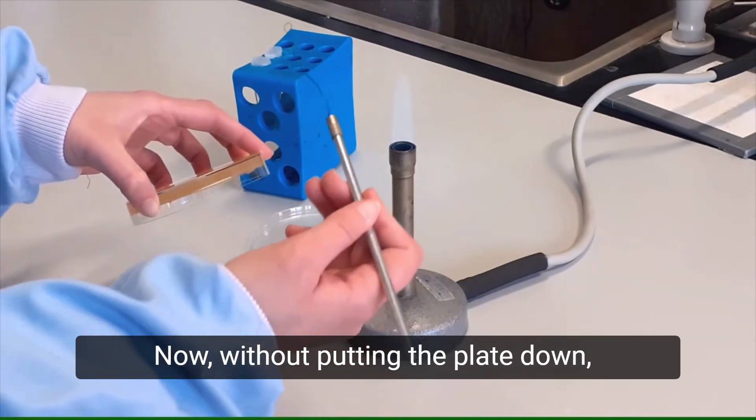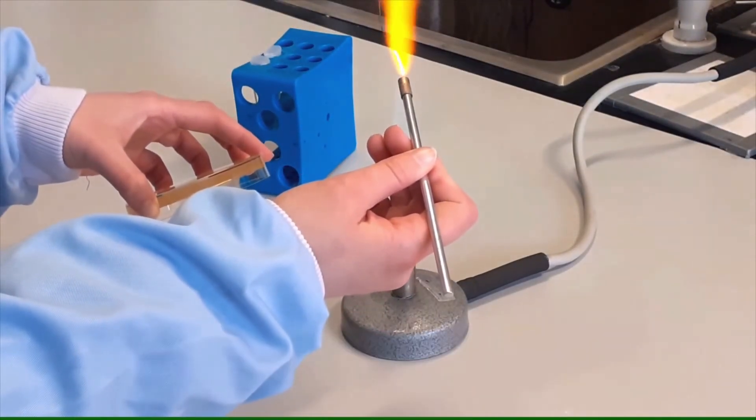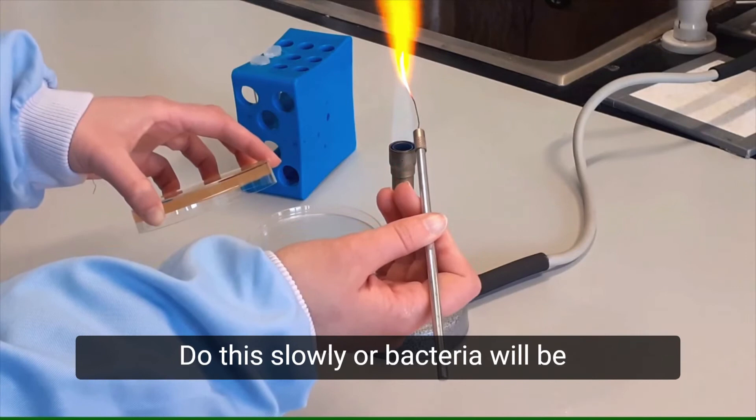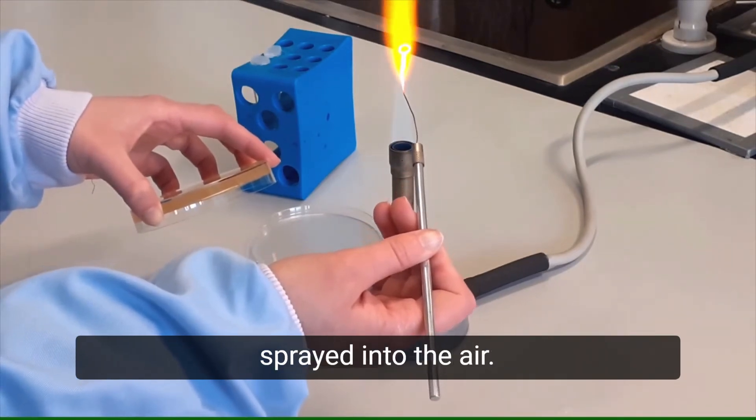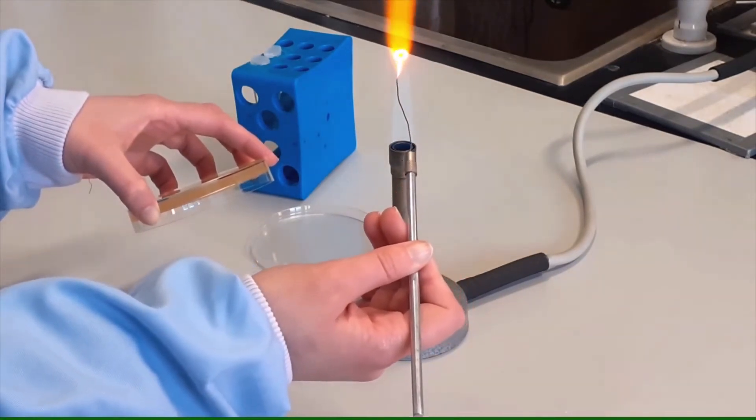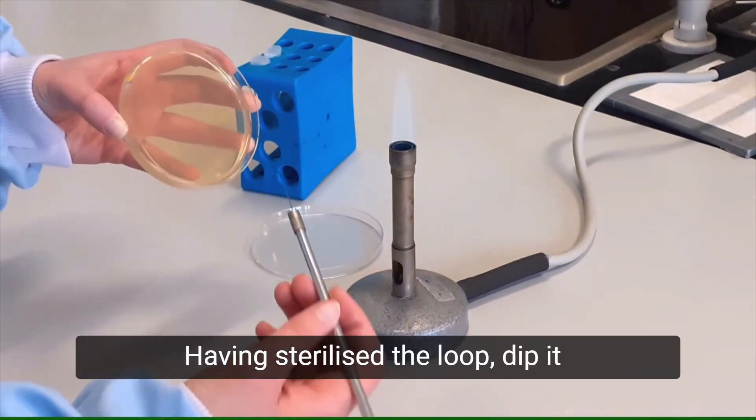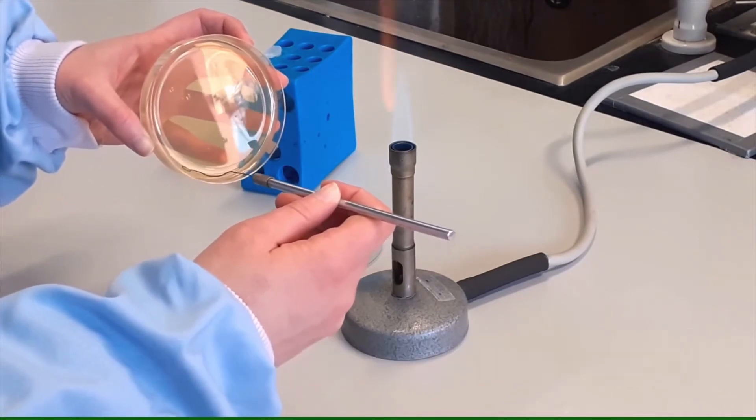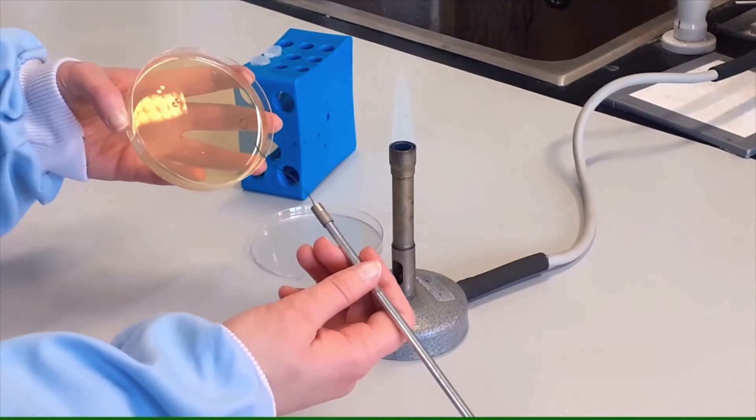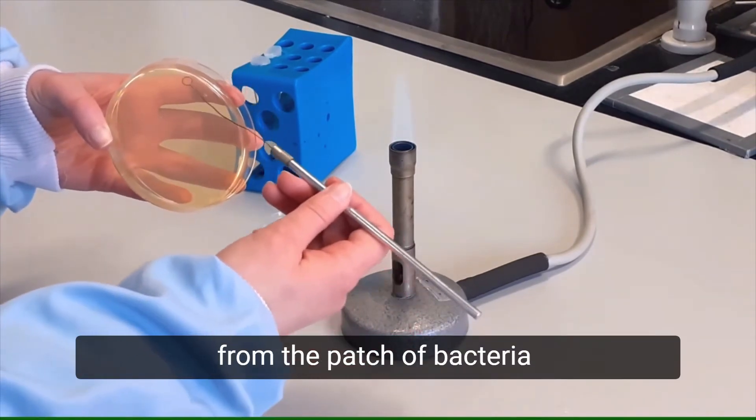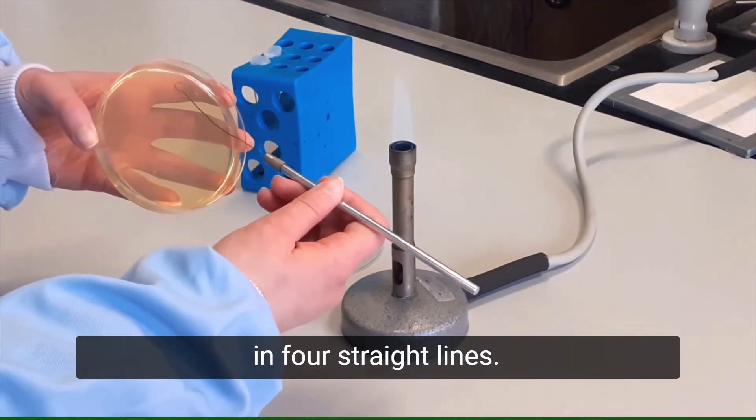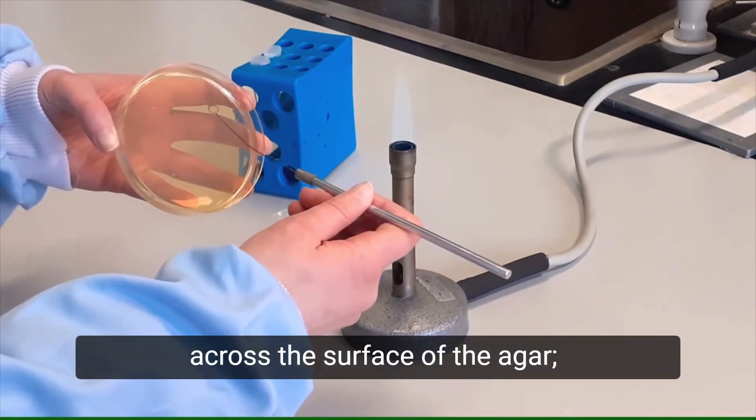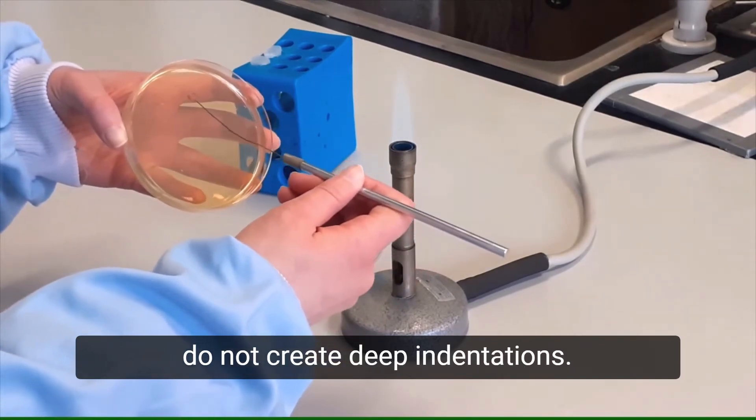Now without putting the plate down, flame the loop again. Do this slowly or bacteria will be sprayed into the air. Having sterilized the loop, dip it into a clean part of the agar plate to allow it to cool. Now streak the loop out from the patch of bacteria in four straight lines. Just drag the loop gently across the surface of the agar. Do not create deep indentations.